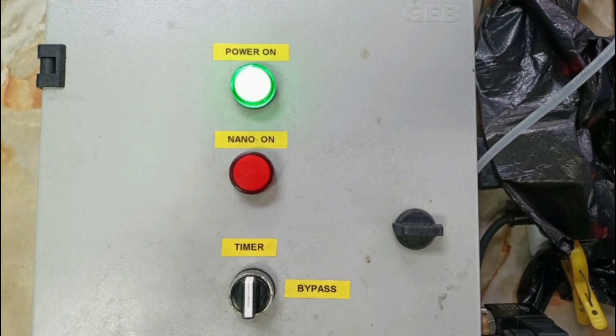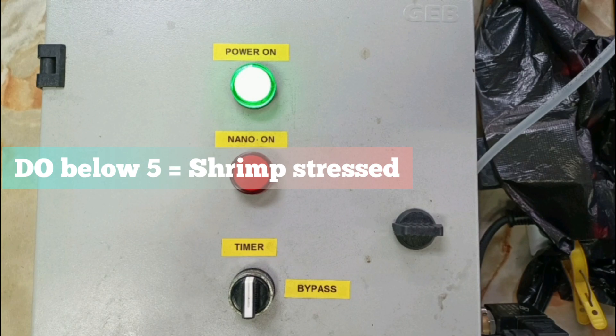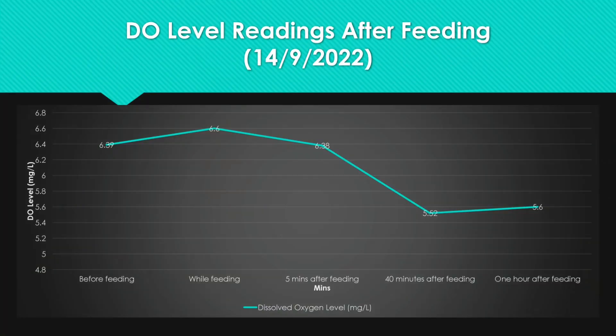However, in order to maintain a minimal decrease in the DO reading, we will adjust this switch so that the reading does not fall below 5. Shrimp will be stressed if the DO level falls below 5. However, the DO level will slowly rise again after one hour. The shrimp have finished eating and are swimming normally in the water at this point, and as a result the DO level goes higher.